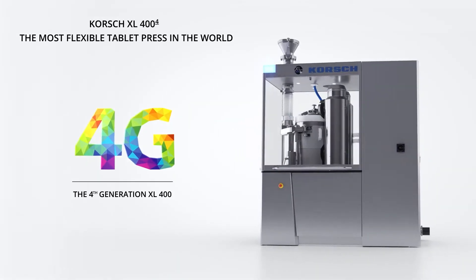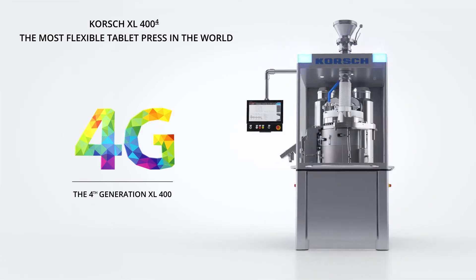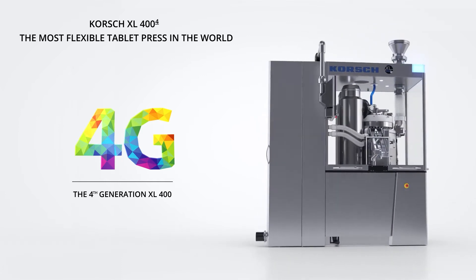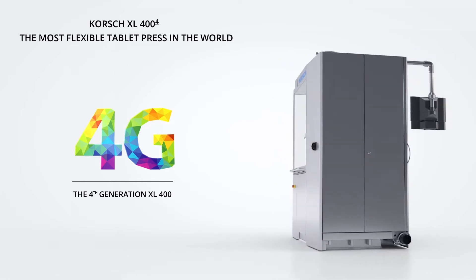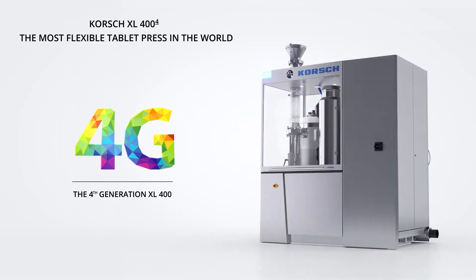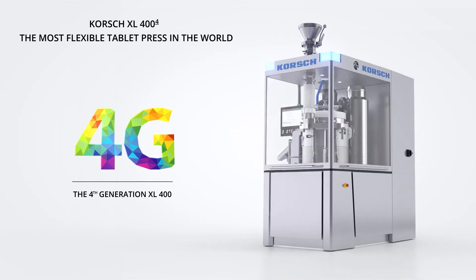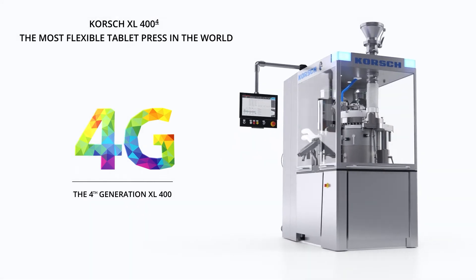Korsh XL404 — the most flexible tablet press in the world. The XL404 concentrates our continued innovation and tablet technology know-how gathered over three XL400 generations. The machine features enhanced accessibility, ergonomics and a compact design with an integrated control cabinet, a new intuitive user interface, and a new smart sensor technology that takes modern-day tableting technology to the next level.